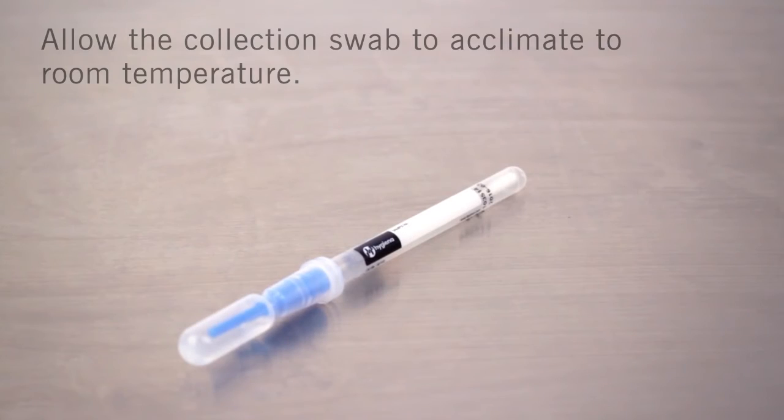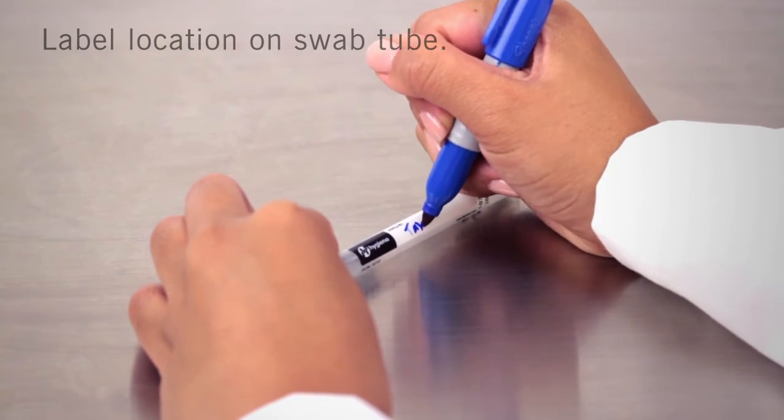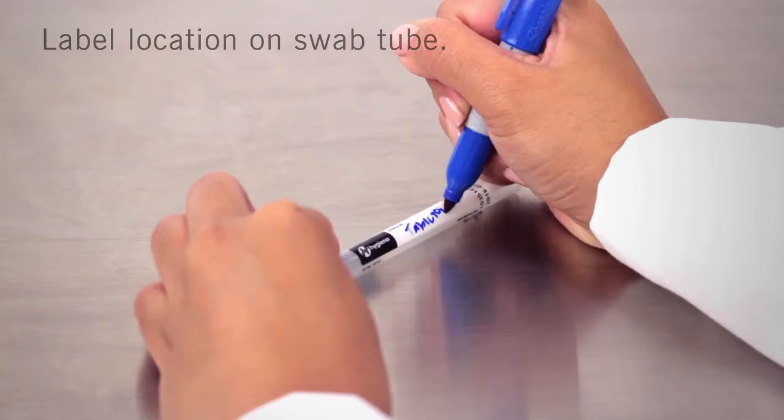Allerflow is a two-step test. The first step is sample collection. Allow the Allerflow sample collection swab to acclimate to room temperature before testing. Write the location on the swab tube using a permanent marker.